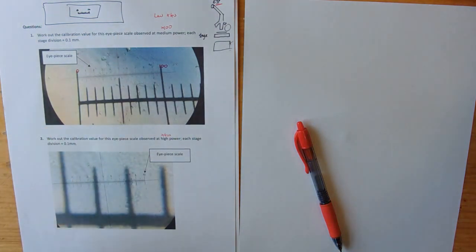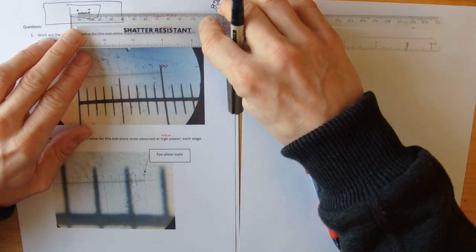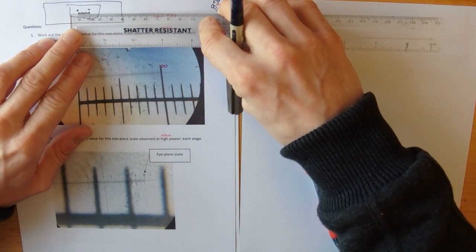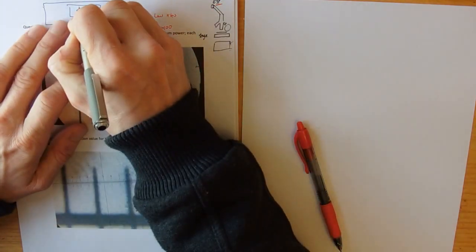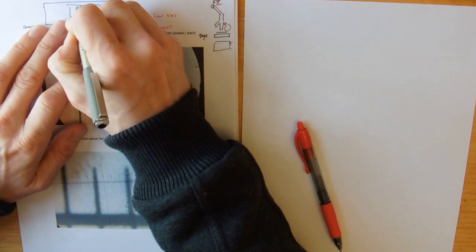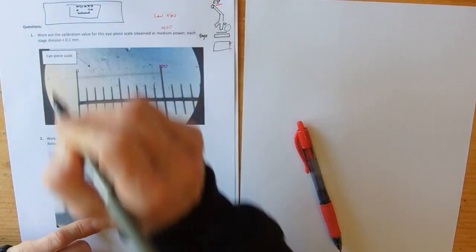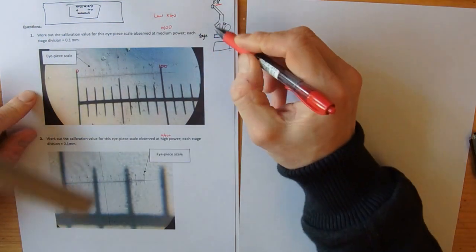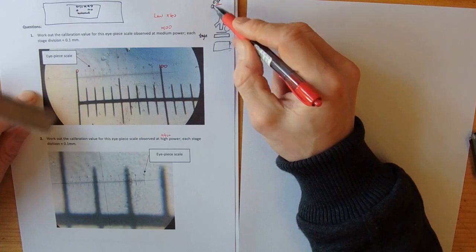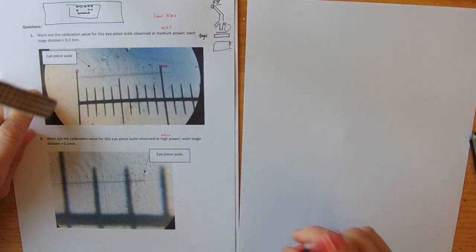When you measure this, my drawing's not brilliant, but it's 1 centimetre long, this scale, and so it's 10 millimetres. So this whole thing is 10 millimetres long. And we use this as a 0 to 100 scale as well. So we just need to calibrate this microscope so that we can chuck the stage away and just use the eyepiece scale to actually work out the size of objects.